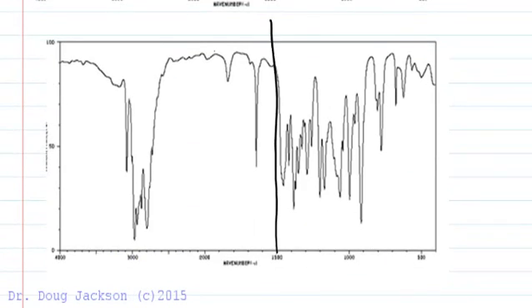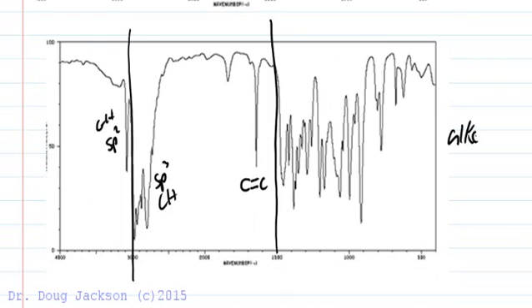To the next. 1500, 3000. We have a sharp needle-like C=C stretch here. We have a very sharp needle-like SP2 CH. We have SP3 CHs here. So we've got at least an alkene functional group in this molecule. Very easy to see and again our noise level here. This is not part of the main signal. Hard to tell on some of these but we want to look at the most intense signals as being the most reliable.